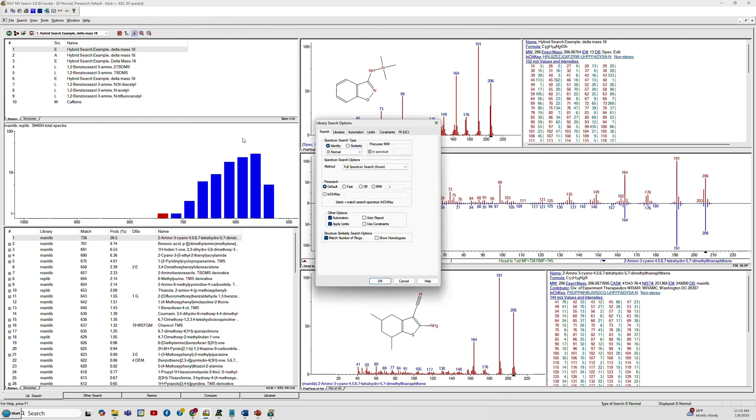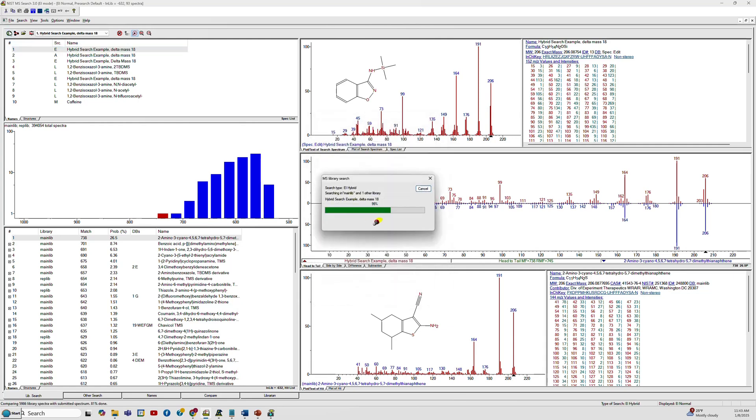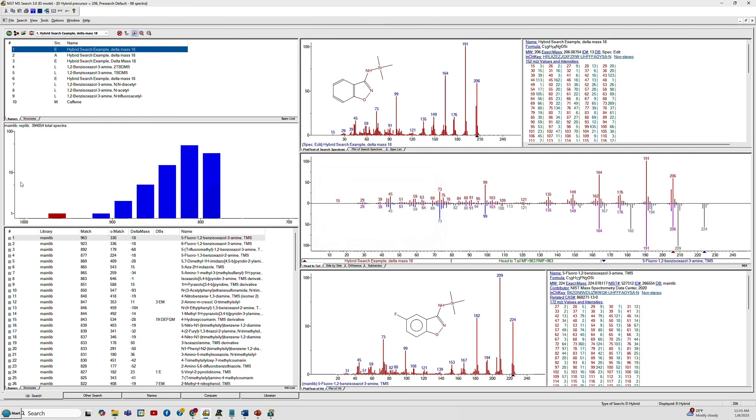So let's switch to hybrid mode. Now when you look at the bottom you see that the hit factors for many of the hits are up in the 900s, so very reasonable hits. If you look at the structures you can see the best hit is now very much related to our unknown.